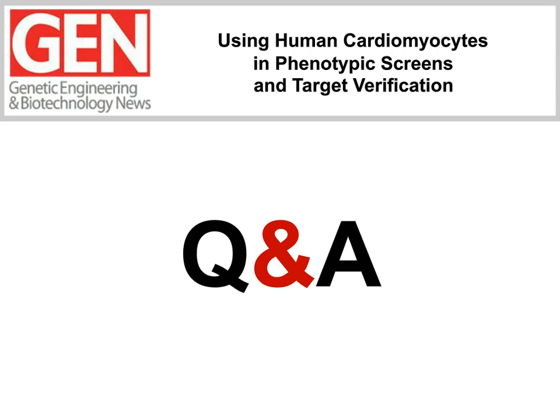Is the screening center moving away from target-based screens toward phenotypic screens? If so, what are some of the hurdles associated with this shift? That is, medicinal chemistry efforts based on the phenotype versus a target? So I have to say we're not really moving away from target-based screens at all. We use the approach that best fits the project, whether it be a target-based or a phenotypic screen. That being said, we have built up quite a lot of capabilities in-house for high-content phenotypic screening, even in ultra-high throughput 1536-based plates.